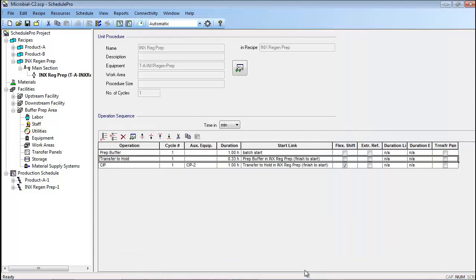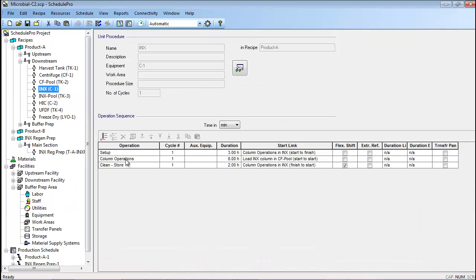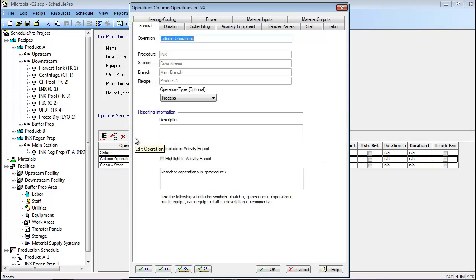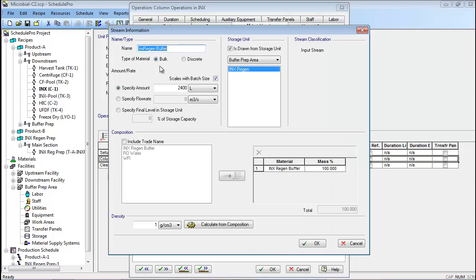Next, the operation titled column operations within the INX procedure of the Product A recipe was edited to ensure that 2,400 liters of INX regen buffer would be consumed during each batch of Product A. The specification of INX regen buffer material consumption was made on the material inputs tab of this operation. The details of the consumption can be viewed by selecting the stream and clicking the edit button. Here, the composition and amount of the input material can be specified, and the storage unit can be assigned.